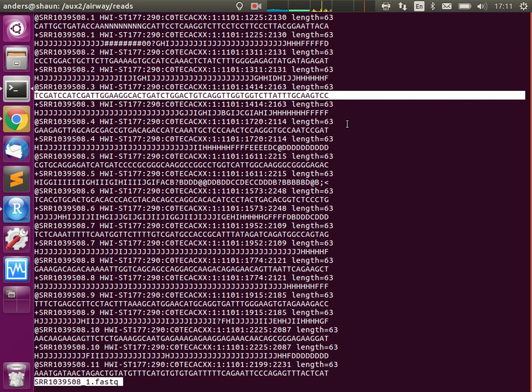But if it's a repetitive sequence, it's probably not transcribed anyway, and if it is transcribed, you probably don't care about it. And if you do care about it, for example, because you might work on the centromere, as some of us do, then of course you need all kinds of special stuff. But for our very simple standard thing, all we care about is roughly where it comes from, and in that case only if it's from some kind of processed and probably coding transcript or long non-coding RNA or whatsoever.